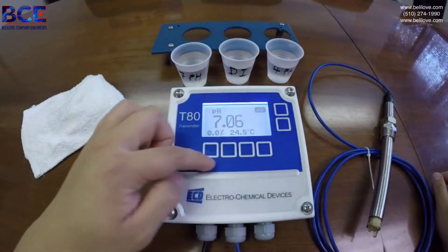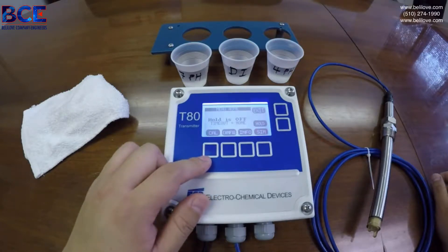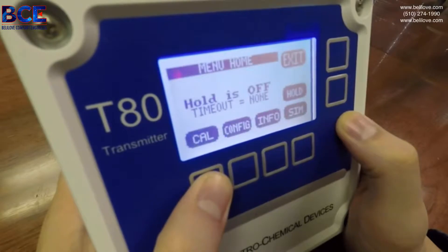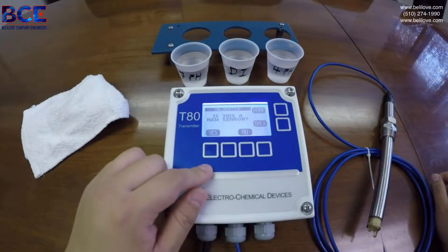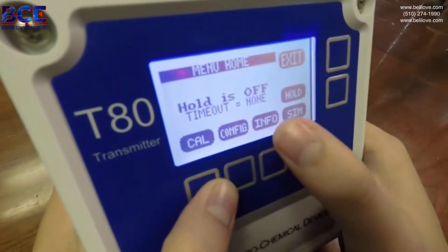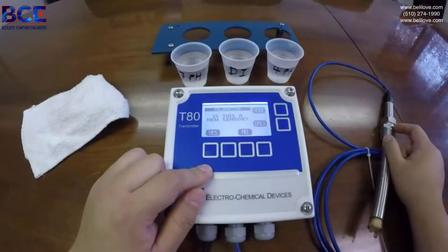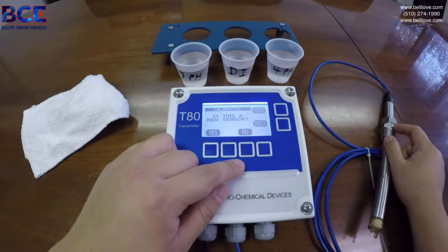Below the screen are 4 buttons. Press any of the buttons twice while entering into the main menu. We will then press cal. We will say yes because this is a replacement electrode. You will pick no if this is just a routine calibration.